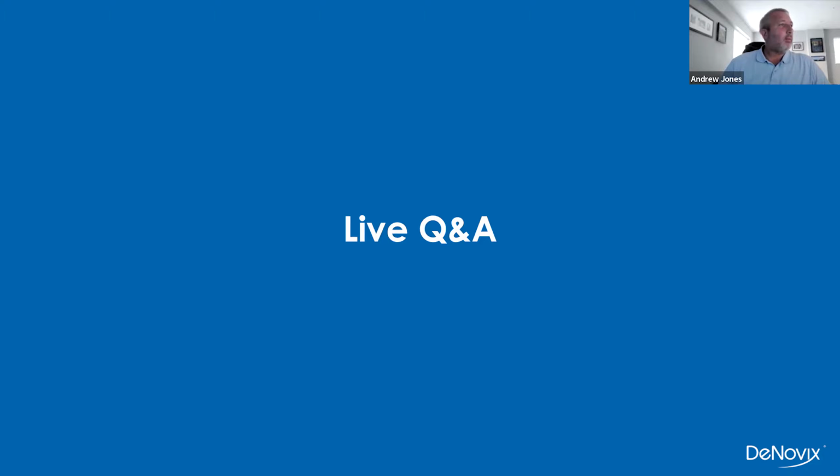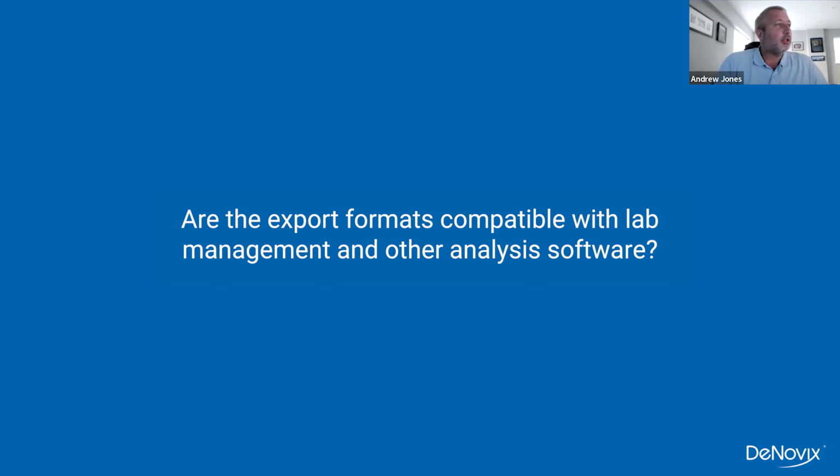Okay. And there was a question about export formats. I know you went through exporting at the end there. But someone was asking about integrating into lab management and other analysis software. Are the formats compatible? Yes, so you can export LIMS compatible, and then if you want to do maybe image analysis, you can export the raw PNG images.